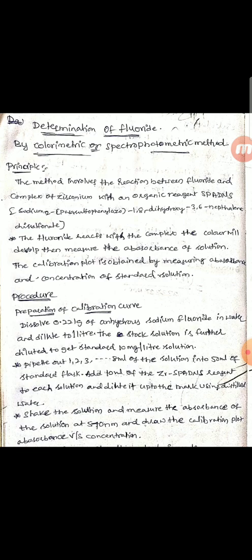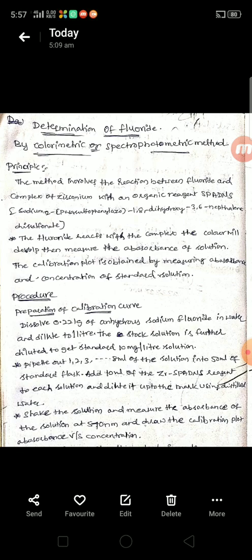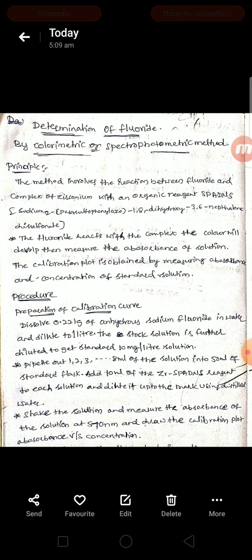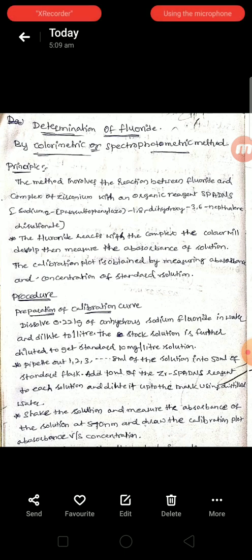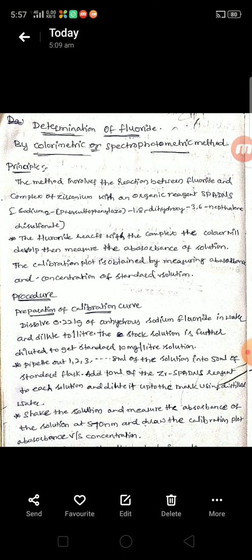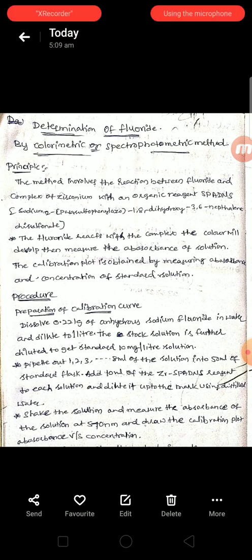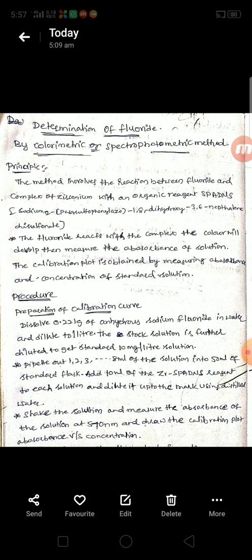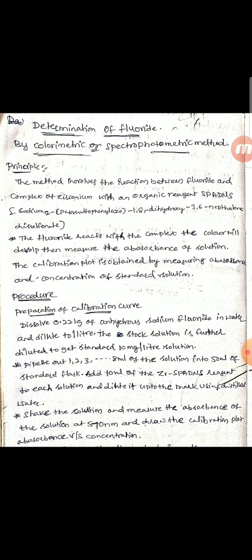The procedure begins with preparation of the calibration curve. To calculate the molar concentration of the fluoride-containing test sample, we first prepare standard solutions. The standard solution is prepared by dissolving 0.221 grams of anhydrous sodium fluoride in distilled water and diluting it to 1000 mL.